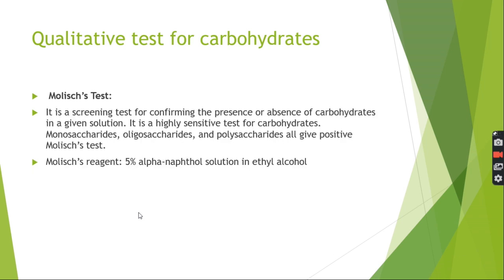Okay. So Molisch test, as I was saying, Molisch test should come out to be positive for all carbohydrates, all type of carbohydrate.